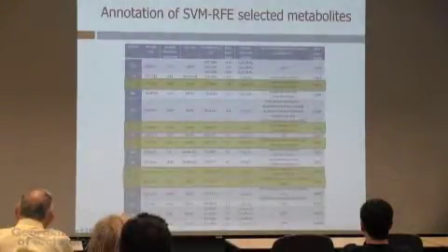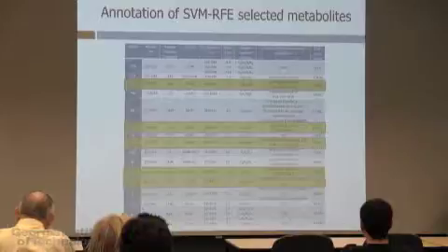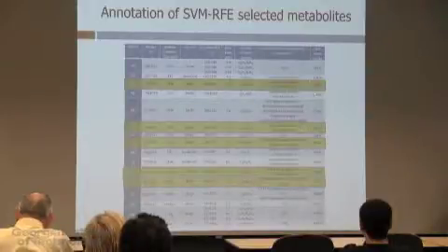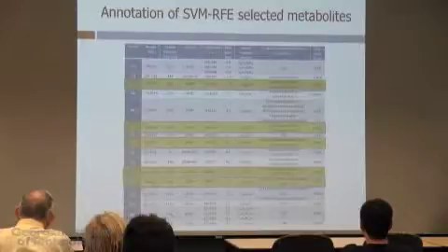In terms of what the metabolites are, again, this is many NAs. Okay, there are many things that we could. In about 5, we spent months and months and months trying to figure out what they are. We just don't know what they are yet. But many of these are lipids. So there's ceramide here, and so on. But you have many interesting molecules. You have, for example, some small peptides.